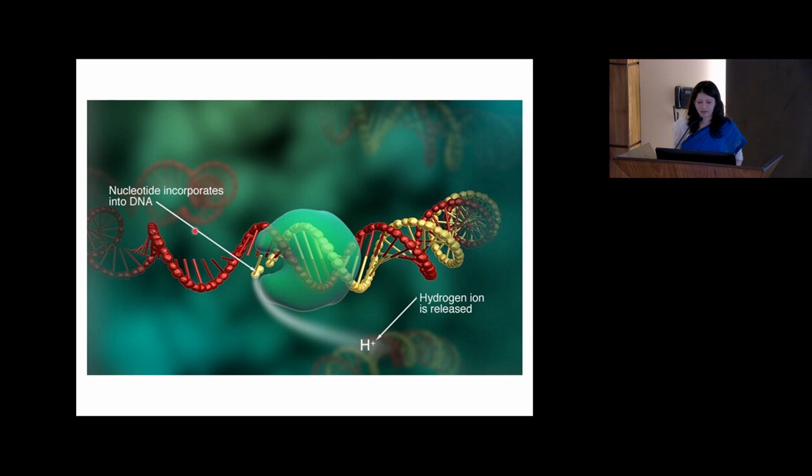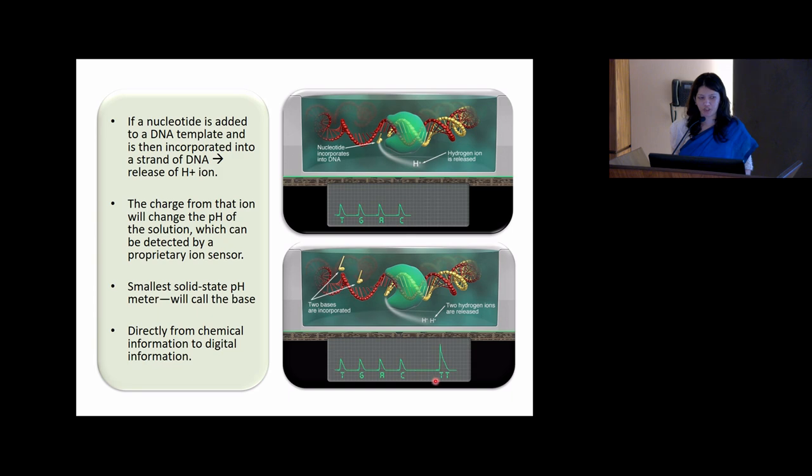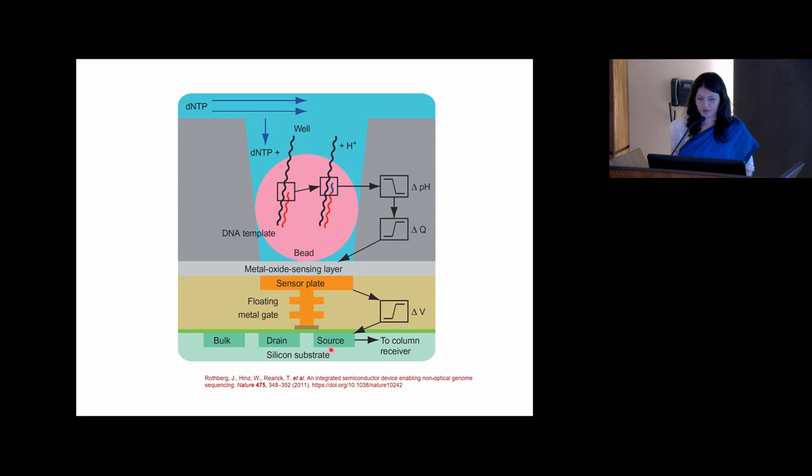When we see the principle, we all know that when a nucleotide is incorporated into the DNA strand or the DNA polymer, there occurs release of a hydrogen ion, and because of that there is a pH change which is recorded. When no nucleotide is incorporated, there is no pH change, and no signal is recorded. If there are two same nucleotides present, the pH change will be double and a double voltage will be recorded. So where is all this going on?